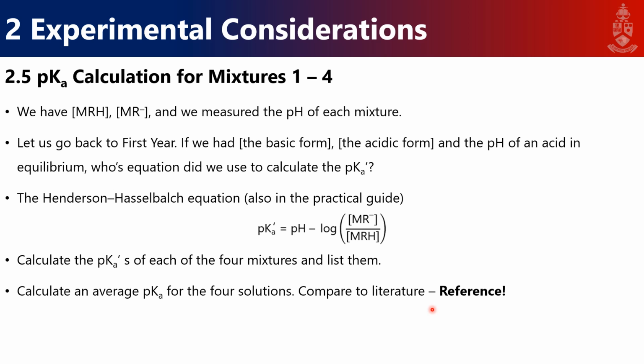You need to reference that, of course, using the RSC referencing style. I hope you still use that. Well, you definitely should be using it by now. And of course, you can discuss any discrepancies that you see, reasons you might think of, etc., in your discussion section and whatnot.